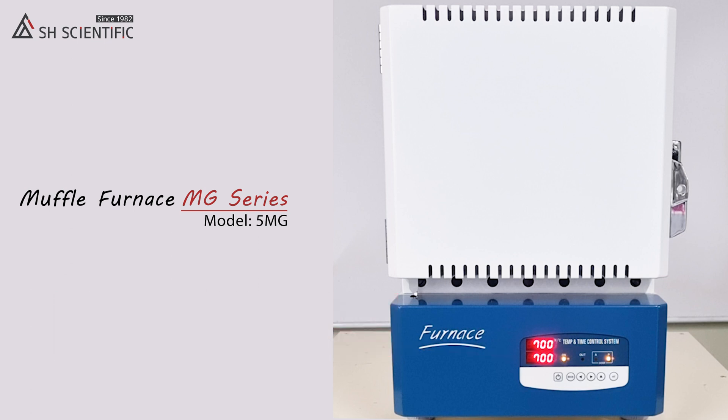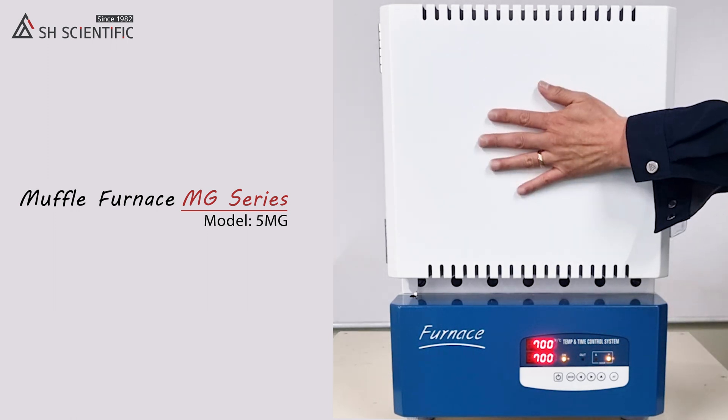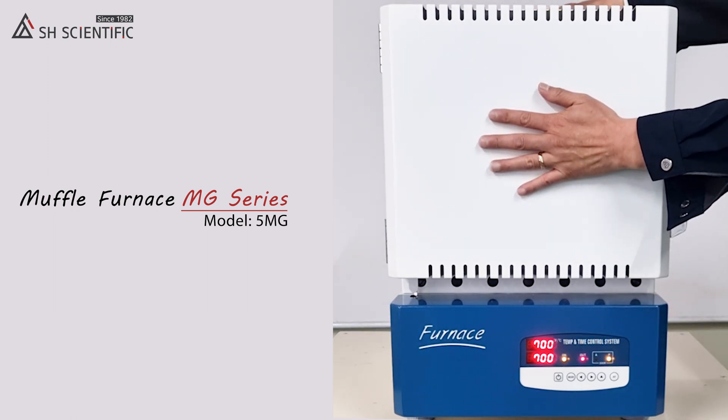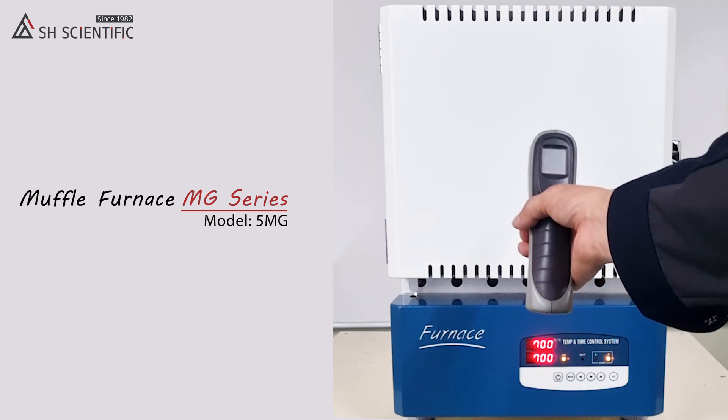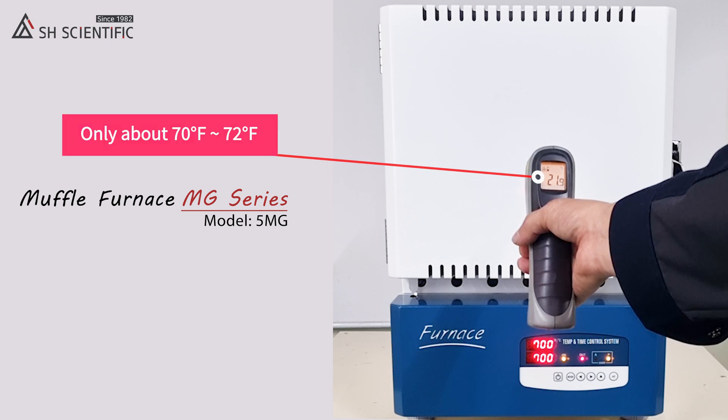Obviously, safety is a concern around anything this hot. But our MG furnaces are double-wall insulated, so they're actually safe to touch while running — it's only about 70 degrees Fahrenheit on the exterior.